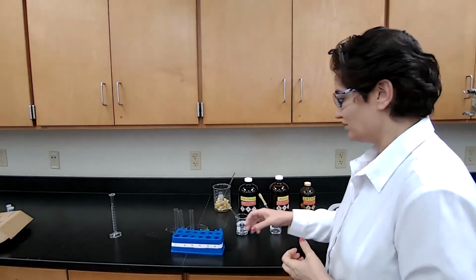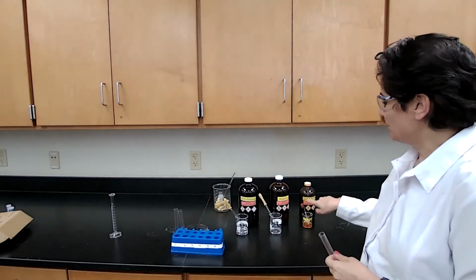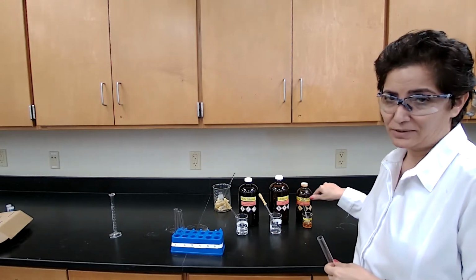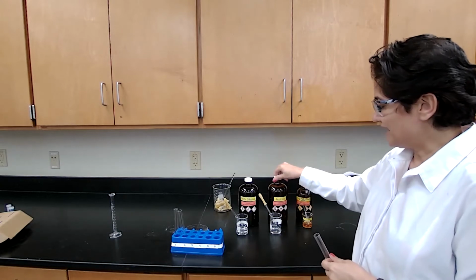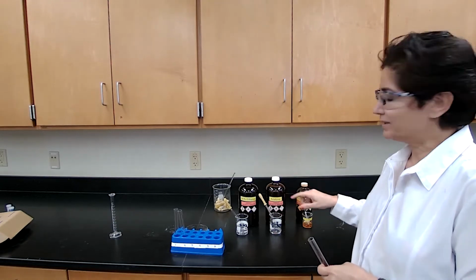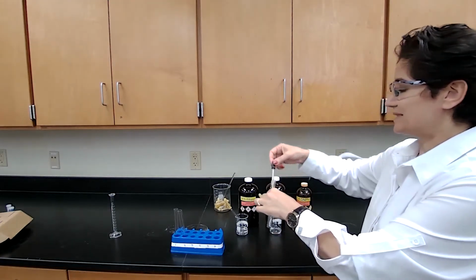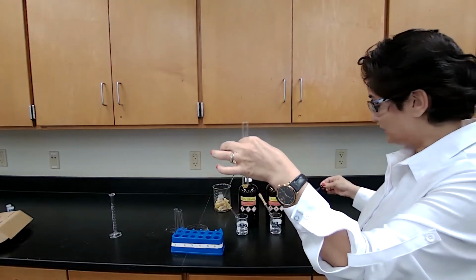The aldehydes and ketones give a yellow color precipitate with this reagent called 2,4-dinitrophenylhydrazine, or 2,4-DNPH is the abbreviation. To test the ketone, which acetone is a ketone, it's a small liquid, it is polar, but we are looking for the functional group. It's going to give a precipitate. A precipitate is a solid that is forming when you mix two liquid solutions.